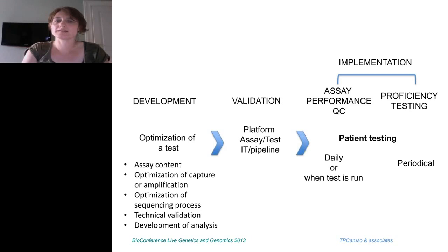And in many cases, you can just buy an off-the-shelf assay, optimize it for your lab, and be on your merry way. In other cases, the labs tend to develop the LDTs because they are worried about the regulatory landscape. And I'll talk about it in a moment too.